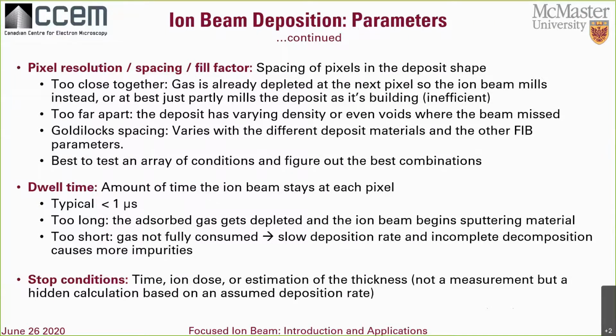The ion beam penetration depth, if you're doing electron beam deposition of, well, let's say carbon, you probably want it to be at least 100 nanometers thick. And you want to make sure when you do the ion beam deposition on top that you're not milling first. So maybe start with a low current there as well.